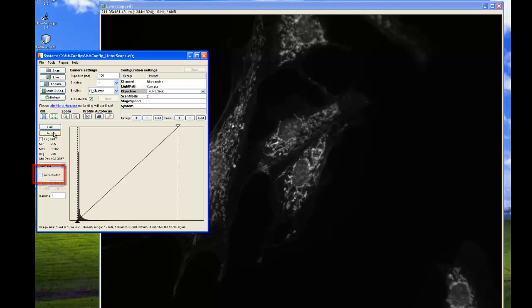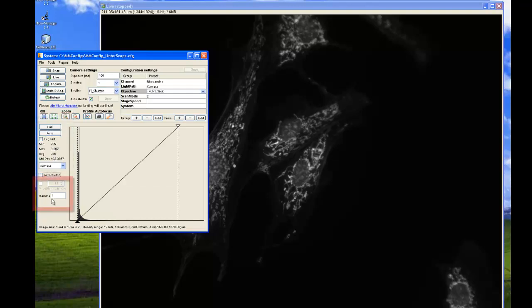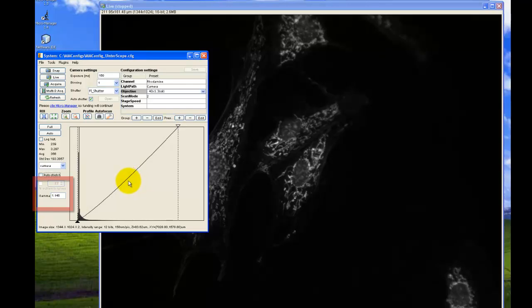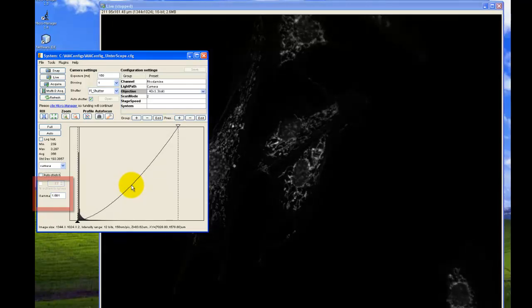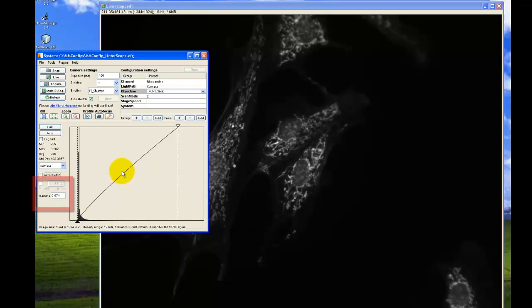You can select Auto stretch to do this continuously. Below these selections, you can see the minimum, maximum, average, and standard deviation of the intensity values of the image. One of the nicest features of the histogram is that you can adjust the gamma function, which is a function of both upper and lower clipping levels.